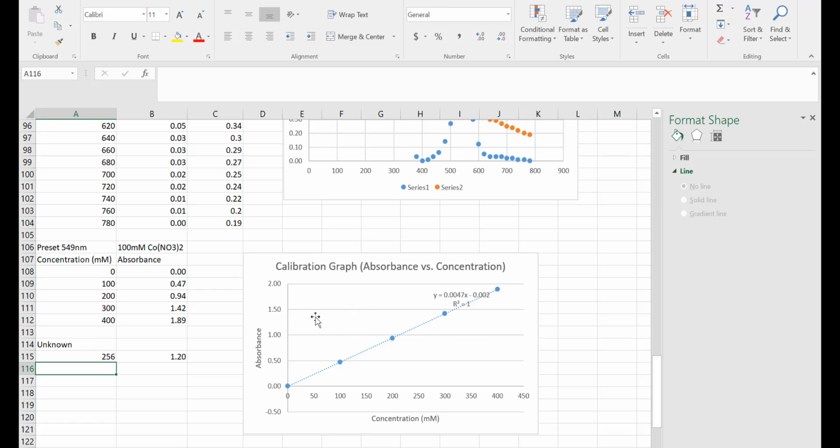Evidently, it's nicer if your calibration graph is a nice wide range so that your unknown is going to be somewhere within that range. What if I had something different? What if I had some unknown here, the concentration was actually 60? What absorbance would I expect for it?